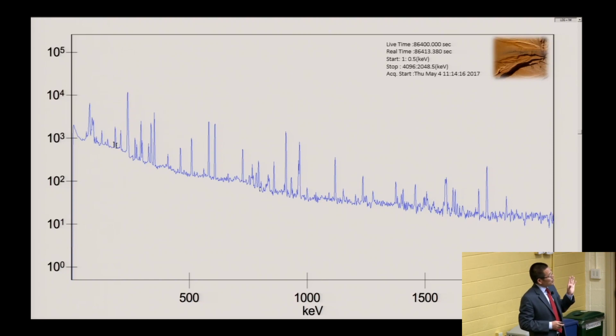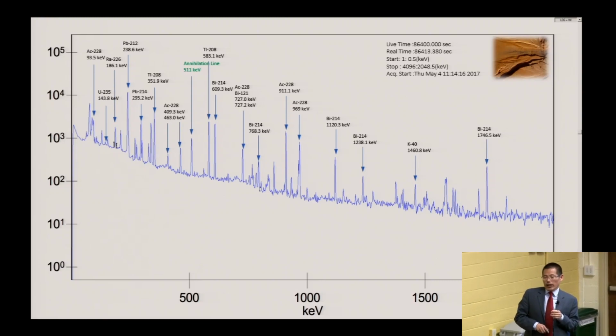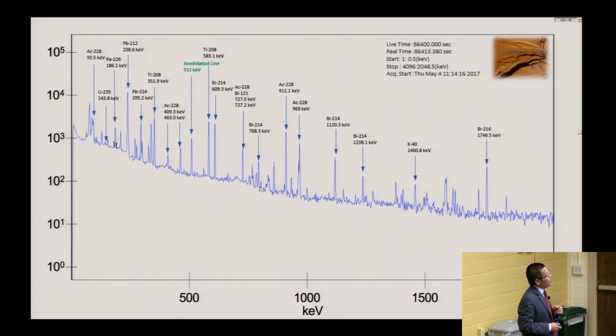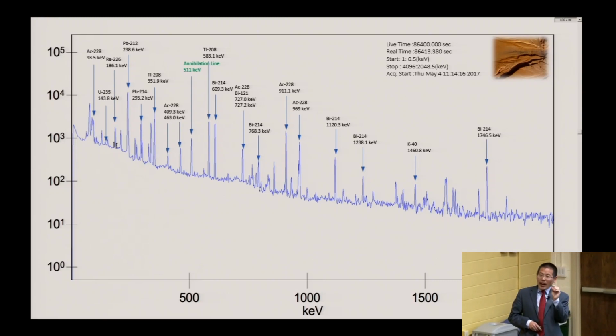This is the spectrum before the irradiation for this sand. And the black sand, you can see a lot of elements in it. And those peaks actually come from the natural radioactivity decay. This comes from that thorium series. So that black stuff is actually more active than your planet.